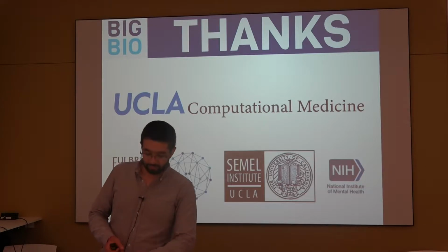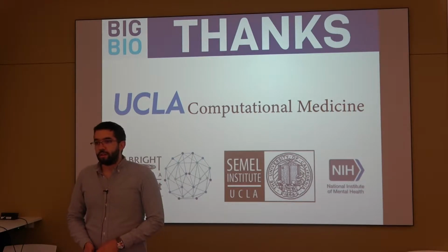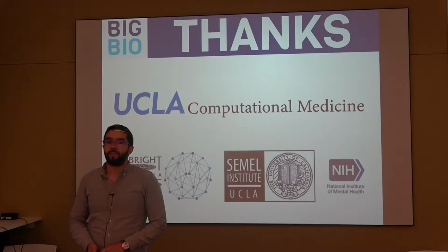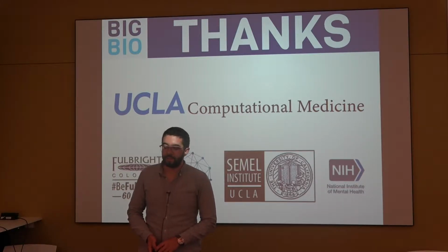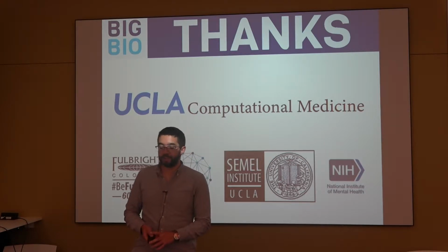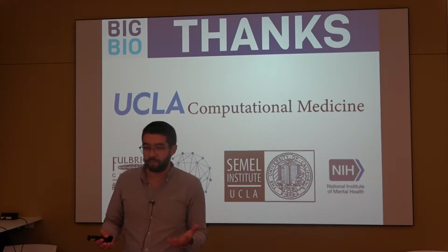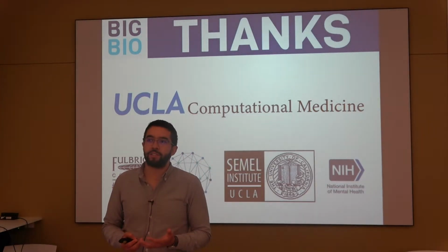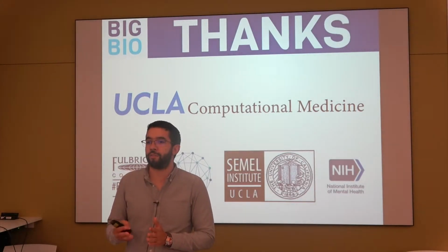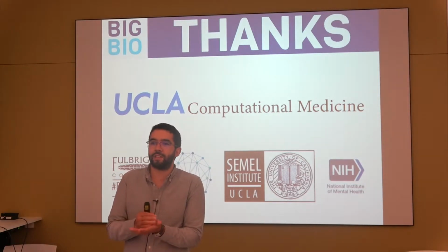How is the score determined? So the Phred score is a standard that has existed for, I think, 30 years already, and it's supposed to represent how sure you are of the quality of this particular base. You can use it just as a scoring metric.